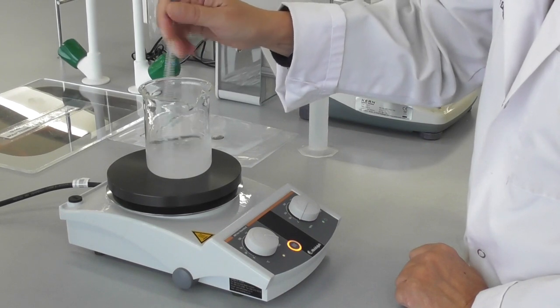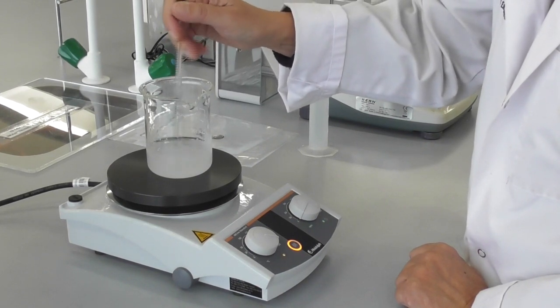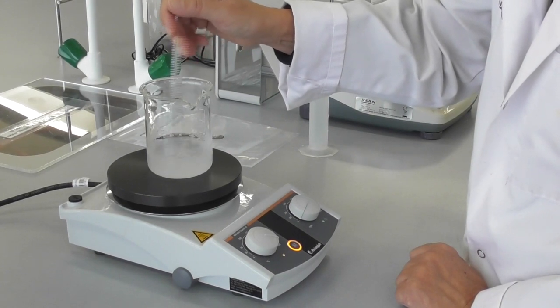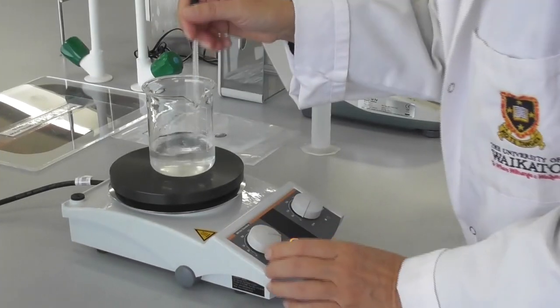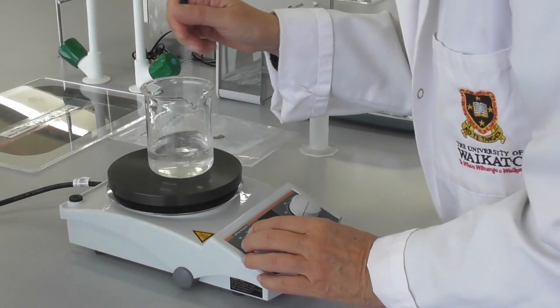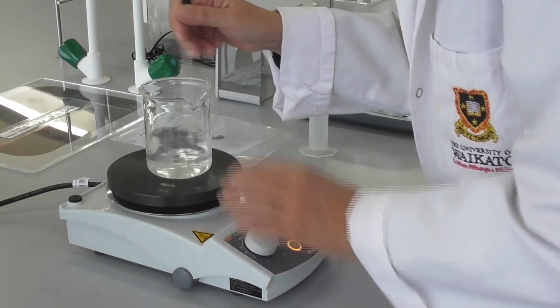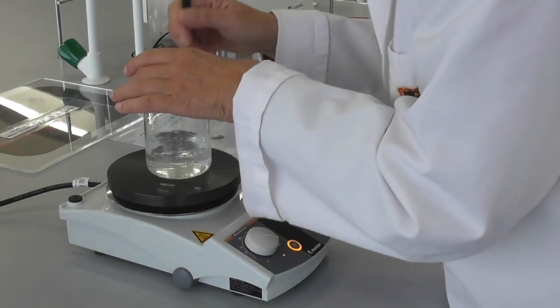Gradually, the solution becomes clear. When it's hot, all the acetate will be dissolved. Then we can take the beaker off the hot plate.